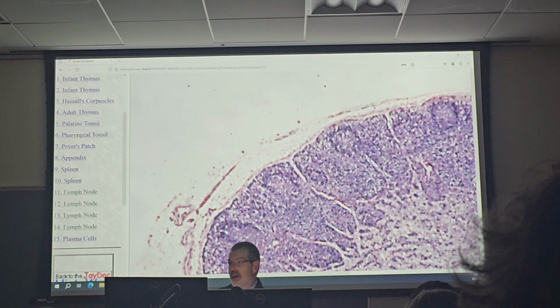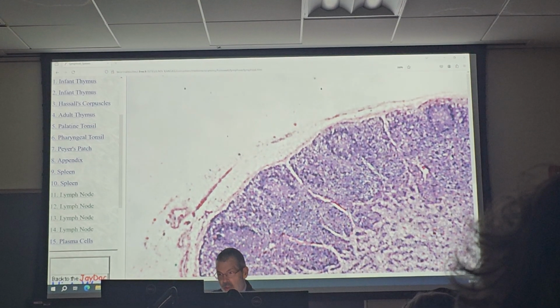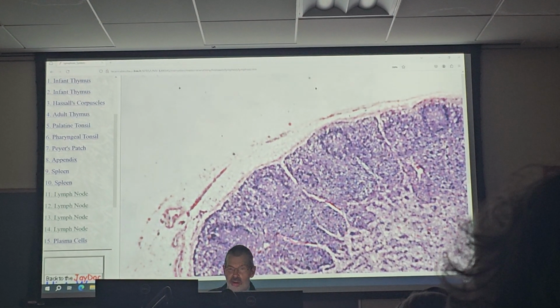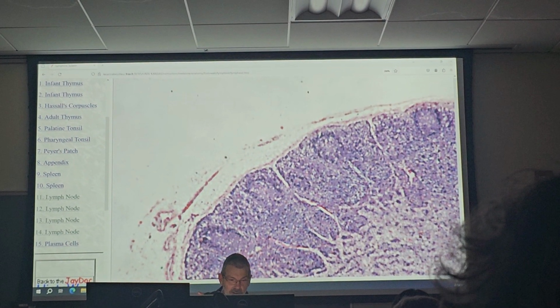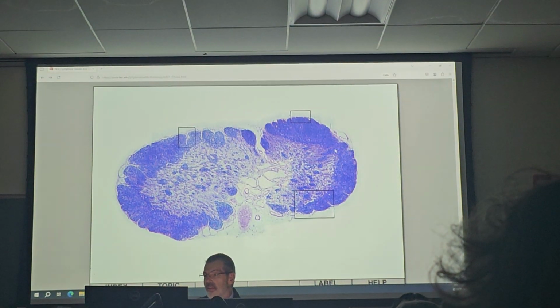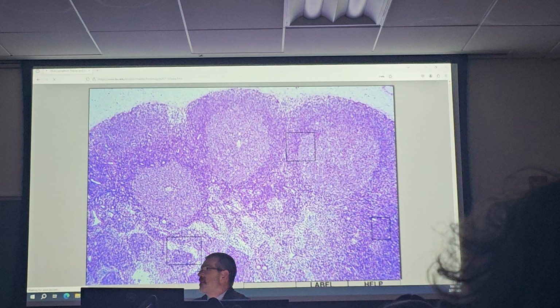Make sense? So I have a nodule with a center there, nodule with a center there, nodule with a center there, and so forth. That's the circle. That's the circles in the dark. Right? That's just the words we give them. So if we go to this picture here, back up a bit. You can't see it nearly as well, but here you can.